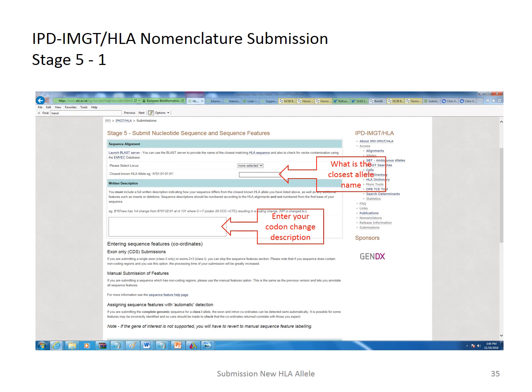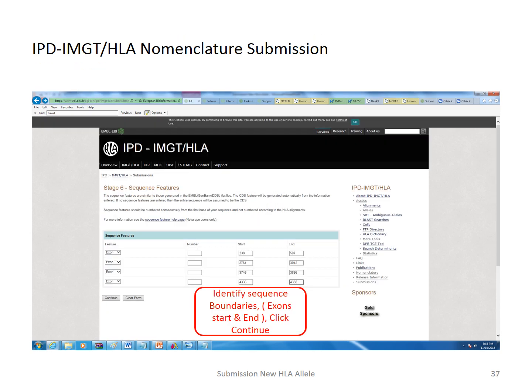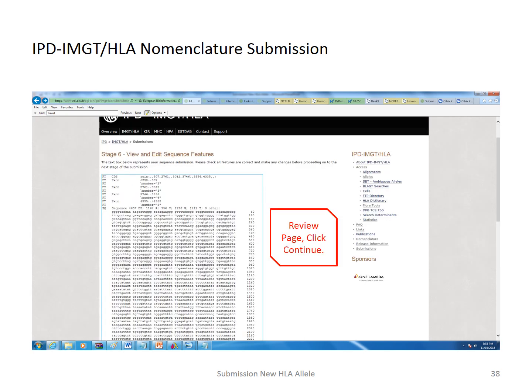Enter your sequence information here. Paste your sequence nucleotide in this space. Enter the exon boundaries, or intron if you like, on this page. Define your sequence. A review file will be shown showing your sequence and the identifiers of your sequence that you have entered.